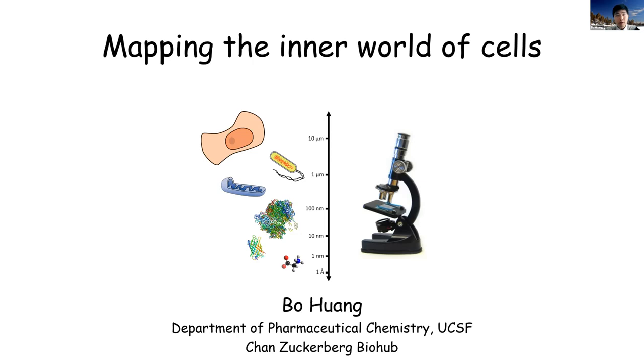And that is one approach. Whereas the Open Cell project is much more emphasizing throughput, because if you want to do that for 30 cell lines, it's okay. If you want to do that for 1,500 cell lines, that's just way too much resource needed to do all these clonal selection and validation. Ours are heterozygous knock-in or polyclonal cell lines, and we haven't done sequence validation for them.